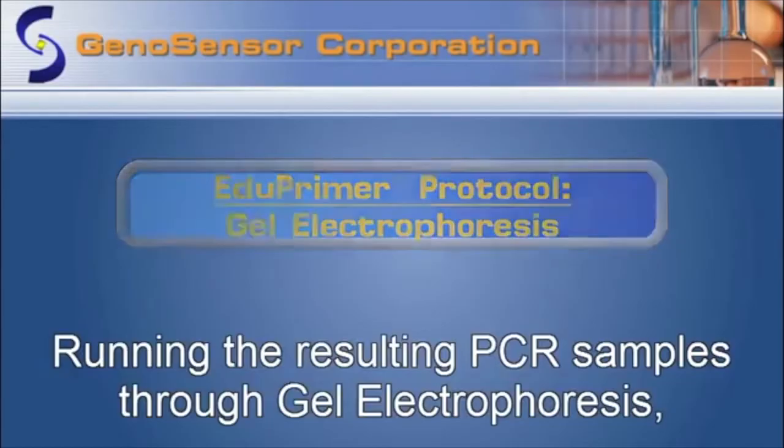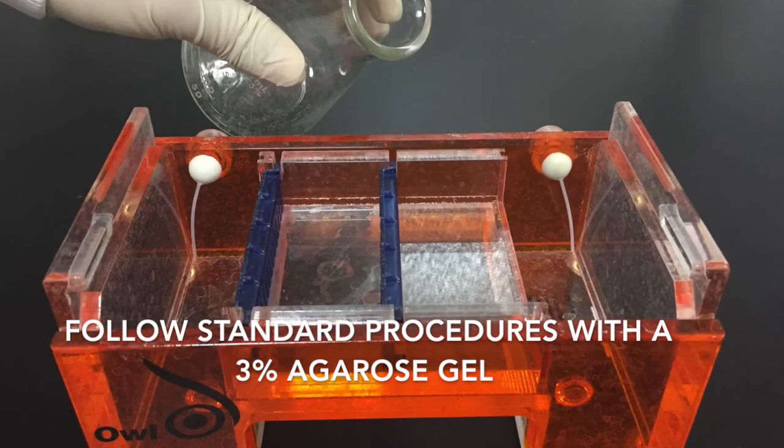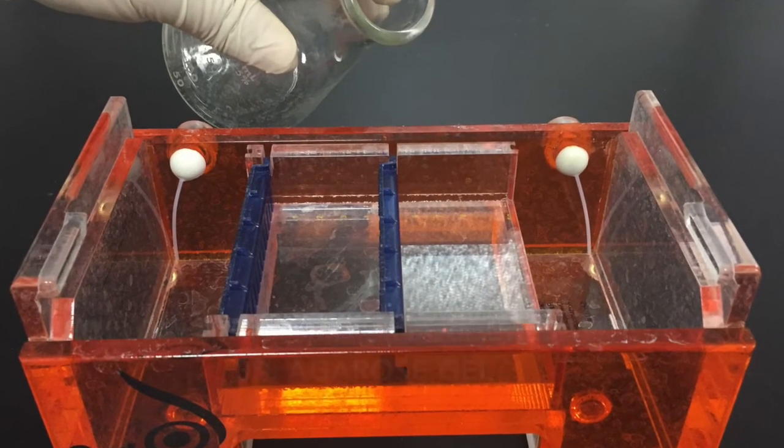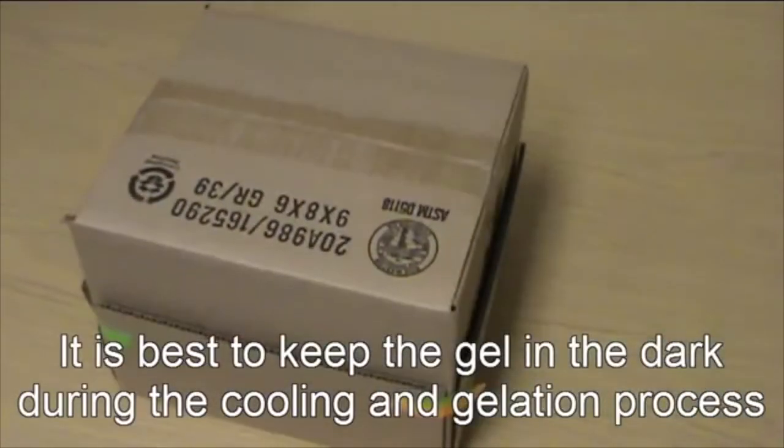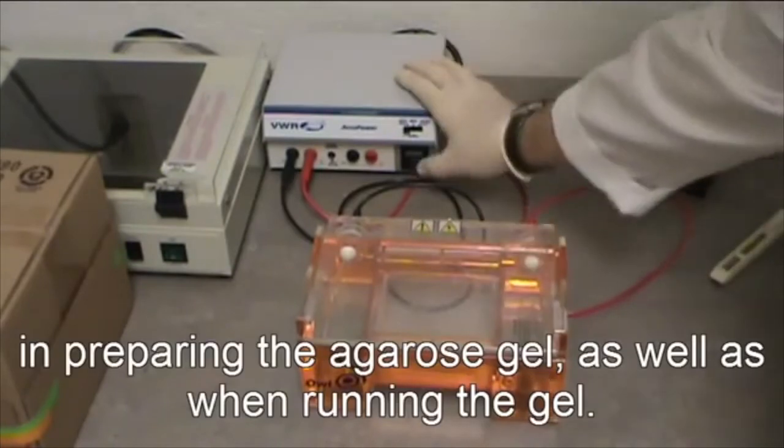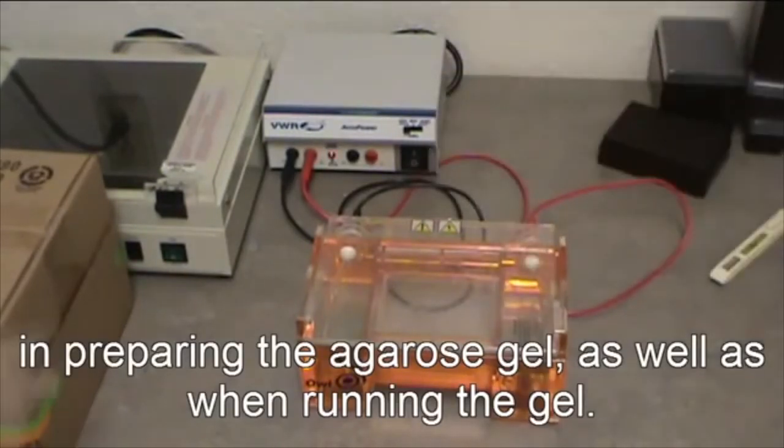Running the resulting PCR samples through gel electrophoresis follows standard procedures with a 3% agarose gel with DNA dye such as Gelred or CyberSafe. It is best to keep the gel in the dark during the cooling and gelation process in preparing the agarose gel as well as running the gel.